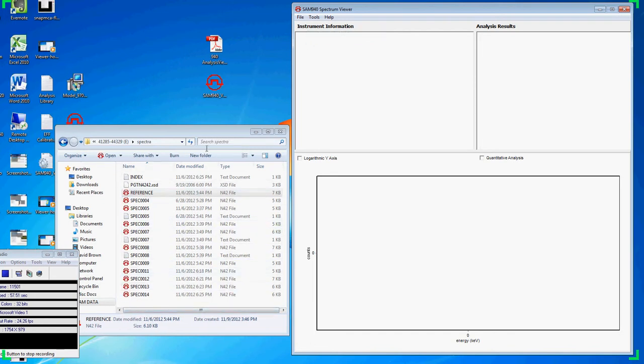To disassociate, simply reselect the same option. The checkbox is an indication that you've associated N42 files correctly.